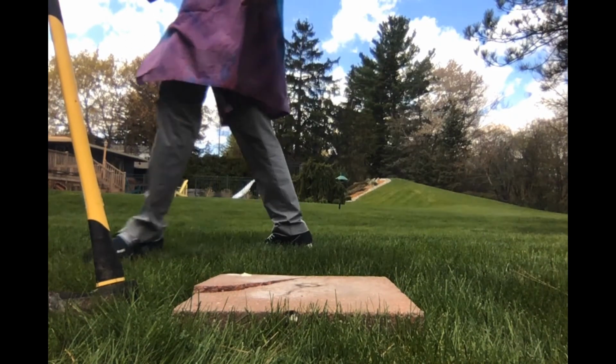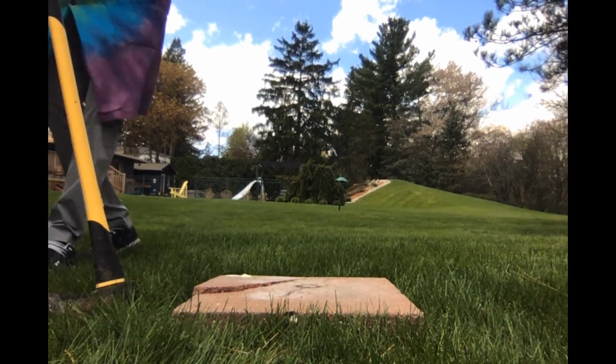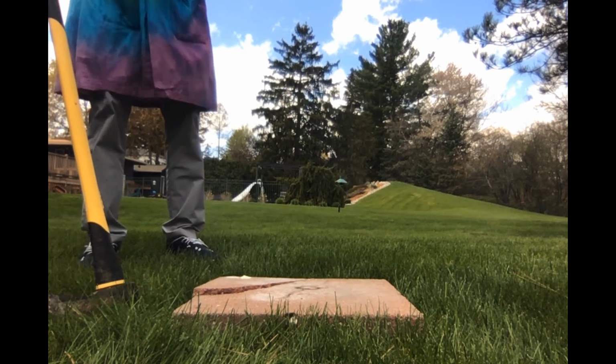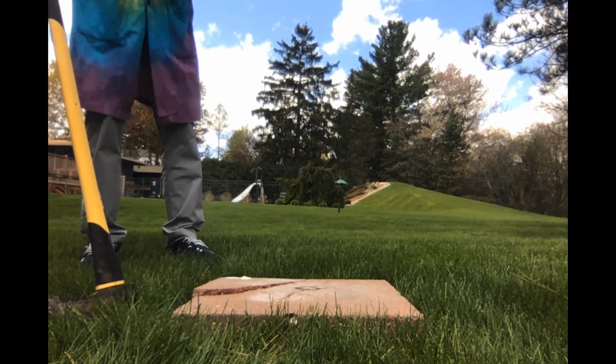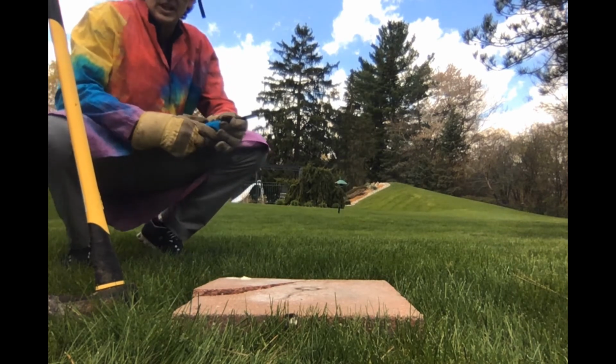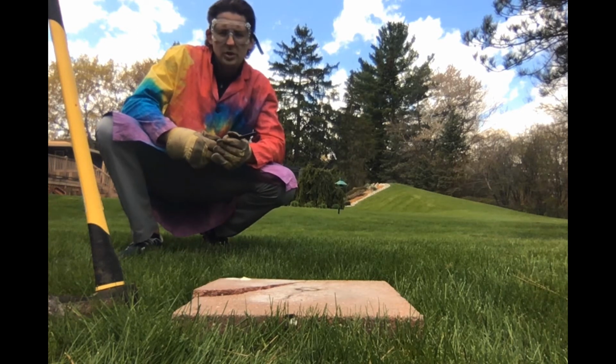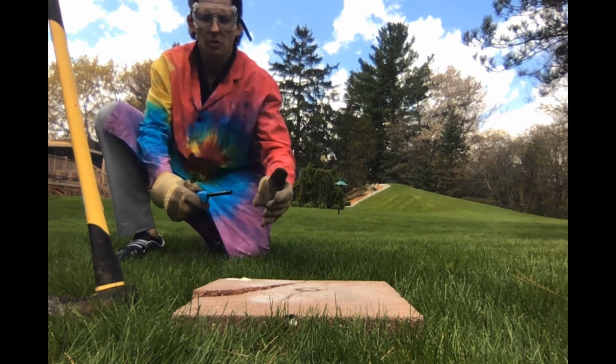So this is a light yellow color. What happened before was just an example of a physical change, hint hint, nudge nudge, and now I'm going to add some heat to it and see what happens here.